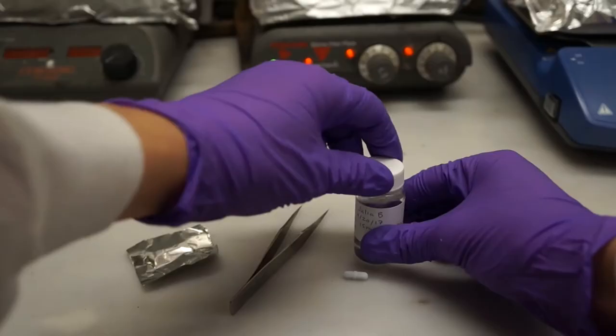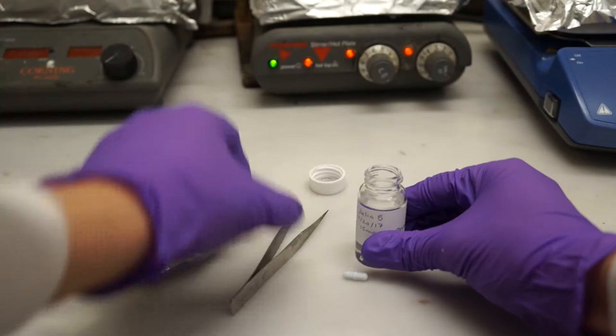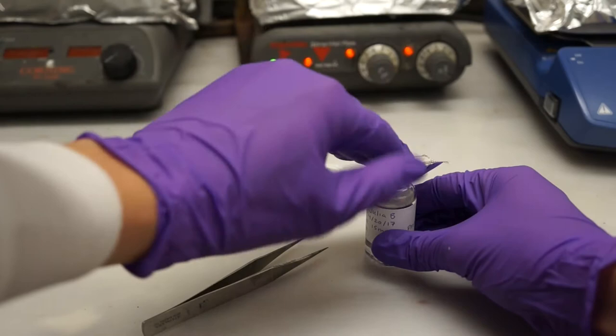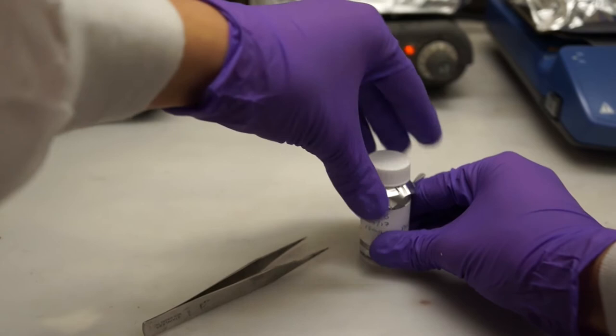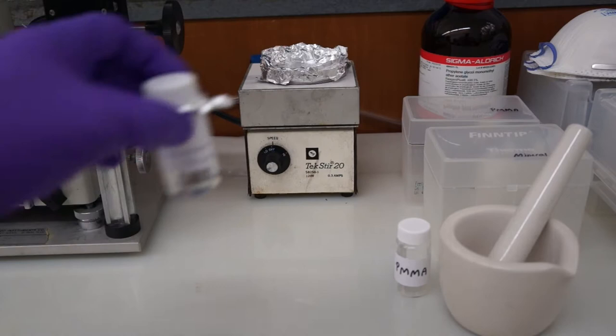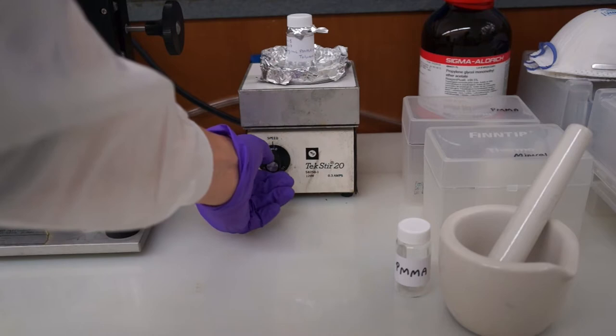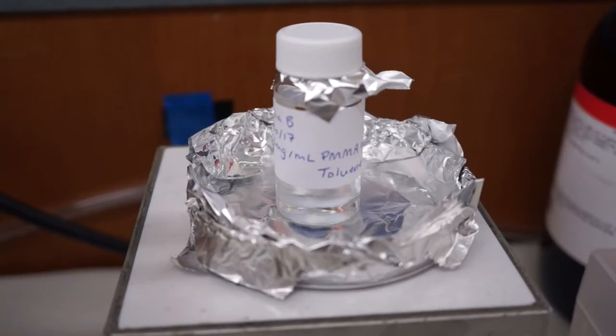There's one last thing to do with the solution under the hood before we let it dissolve overnight. Take the cap off the vial and put in a magnetic stir bar. And before putting the cap back onto the vial, place a piece of tin foil in between. This way, if the vial gets knocked over, the toluene will not dissolve the cap which is made out of plastic. Now we can place our newly made PMMA solution onto our magnetic stir. Turn it on so that the stir bar starts to spin. This facilitates the dissolution of the PMMA into the toluene. And now, leave it overnight.